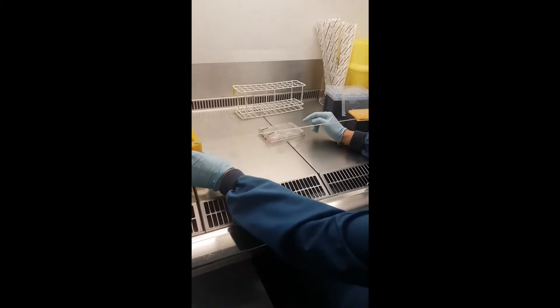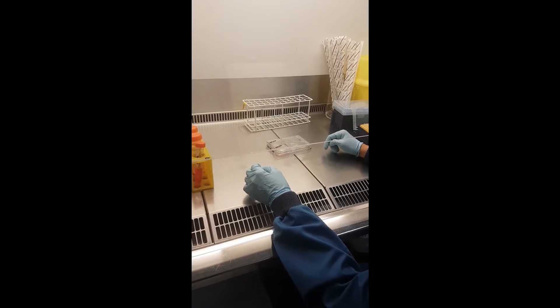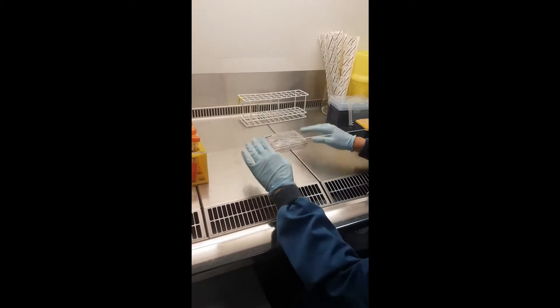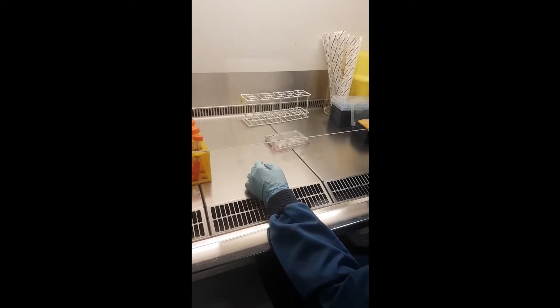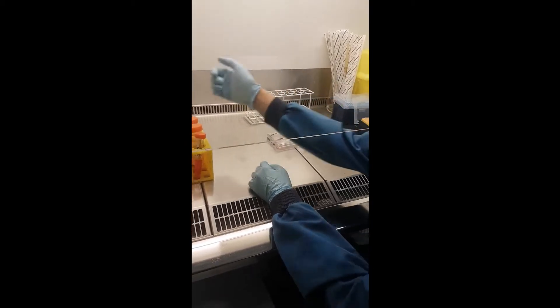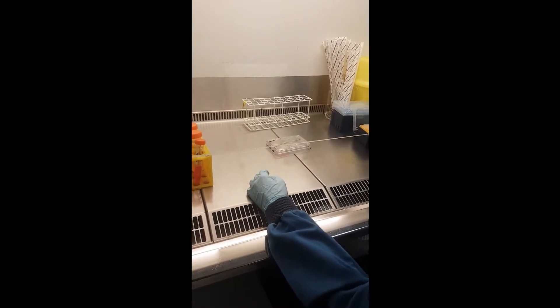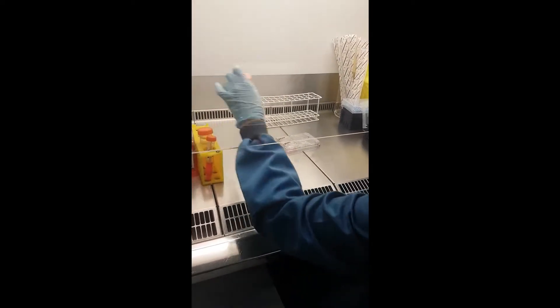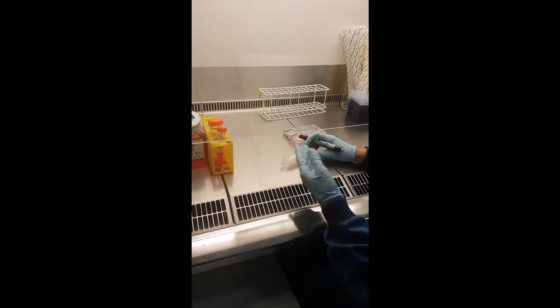Prevent blocking the airflow that goes like this — that's why we keep all the glasses at this side and the boxes at this side. You also want to prevent a lot of movement because it disturbs the airflow. Don't put all your pipettes there; put the boxes you need on this side to prevent too much movement in the airflow.